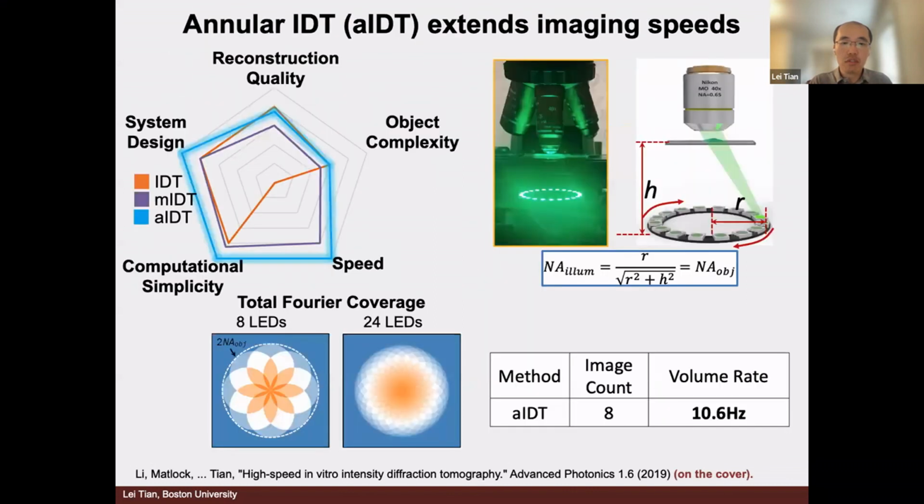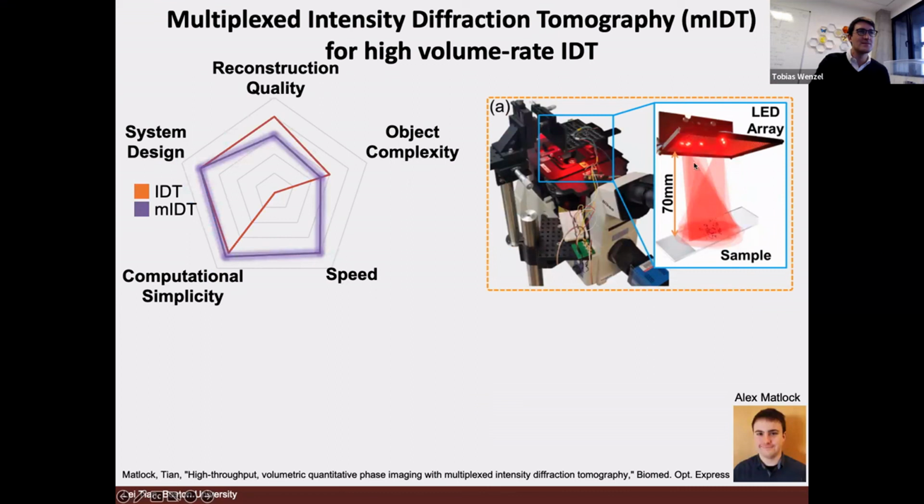So then, complexity of the LEDs. The first version we built was definitely overkill, because in total I think we had more than 1,000 LEDs. This was an off-the-shelf Adafruit LED matrix when we started the project.